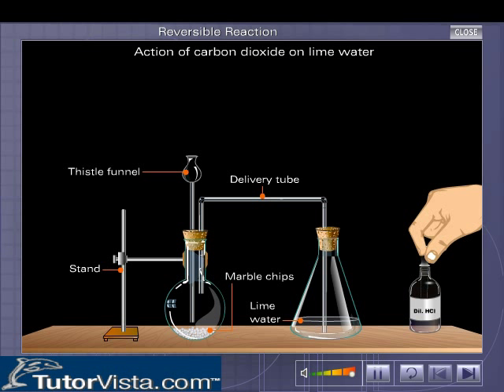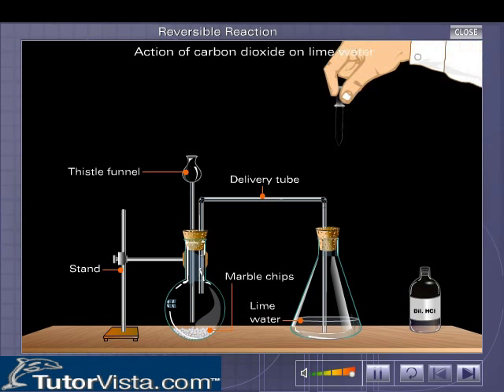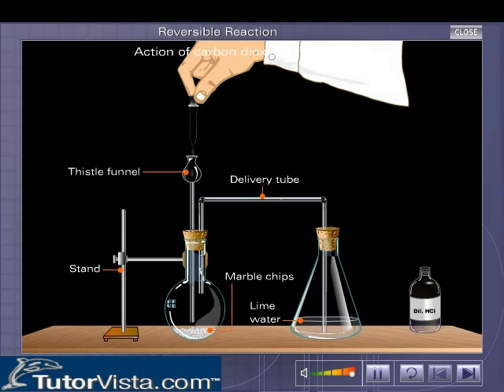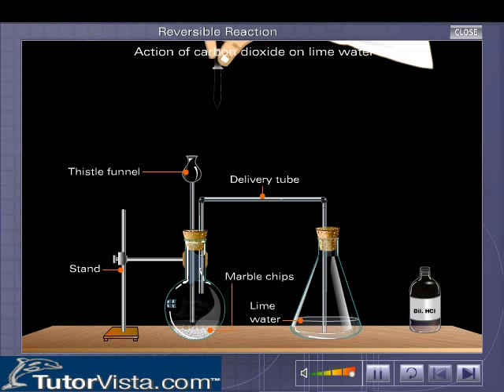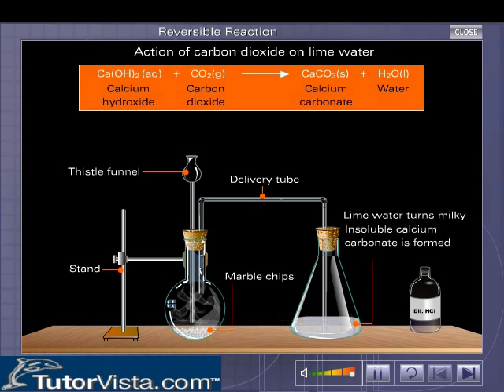Drop dilute hydrochloric acid into the round bottom flask through the thistle funnel. Brisk effervescence takes place liberating carbon dioxide gas. The gas formed bubbles into the lime water turning it milky due to the formation of insoluble calcium carbonate.